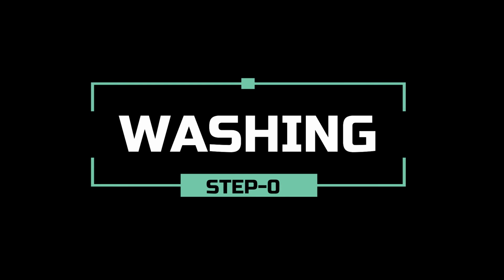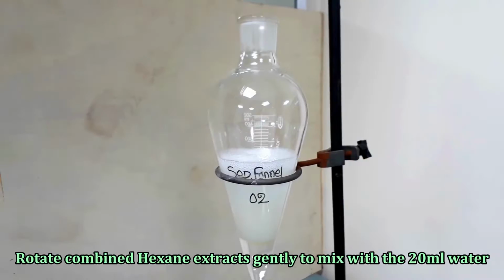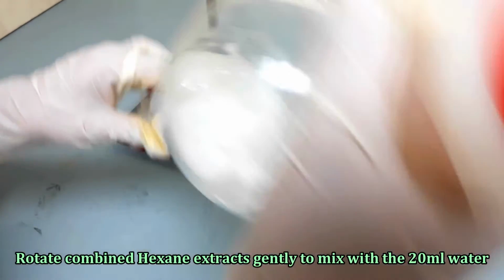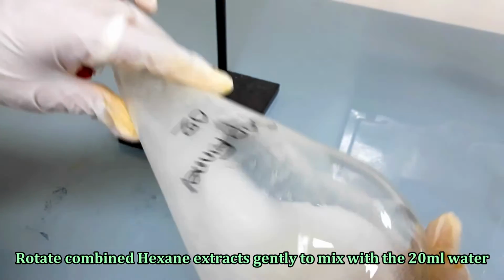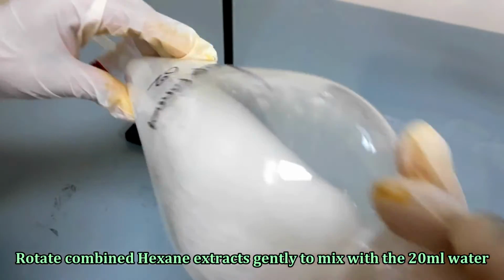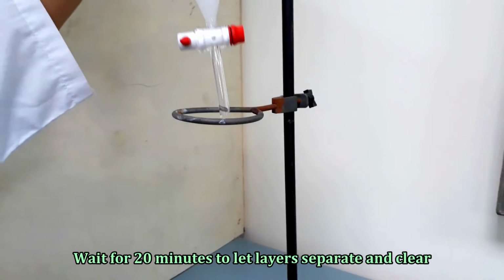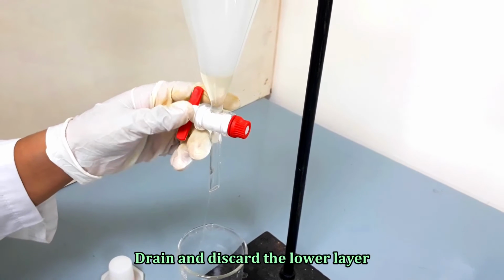Now we will wash the extracts several times in different ways. Rotate the combined hexane extracts gently with the 20 ml water which was added during the first extraction. Wait for 20 minutes to let layers separate and clear. Drain and discard the lower aqueous layer.